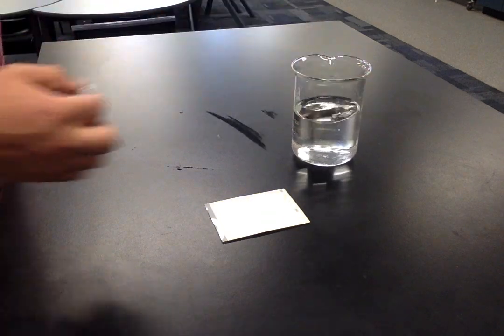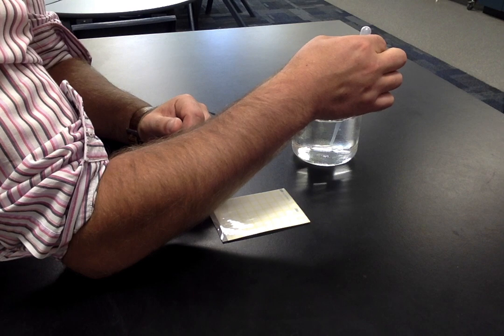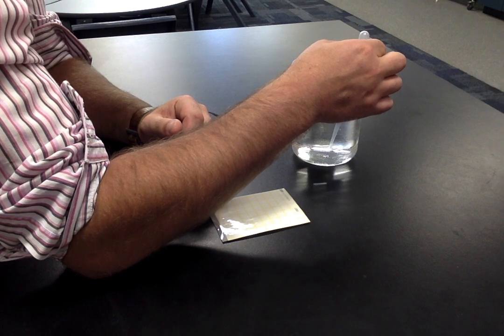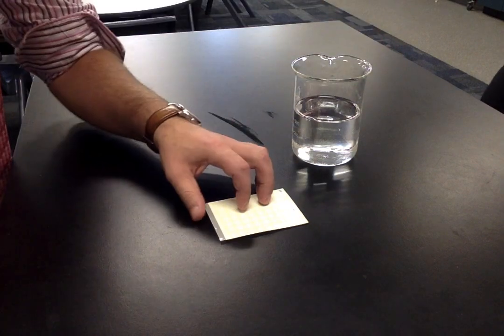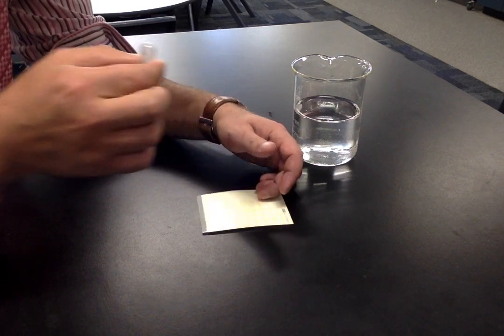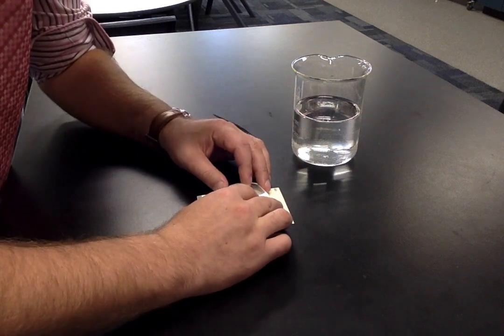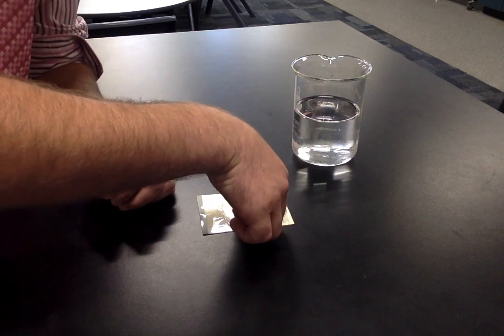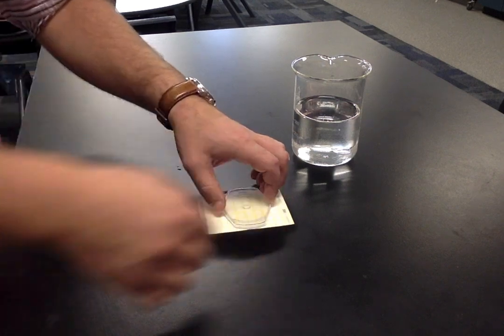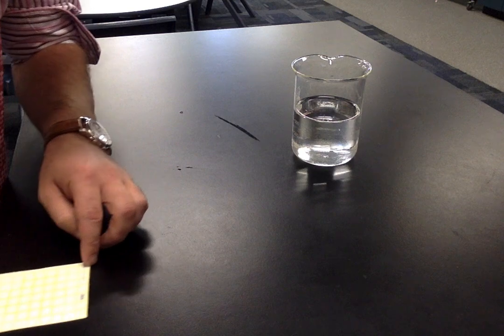Draw exactly one ml of distilled water into a pipette. The experimental control is not going to get exposed to any of the salad — it's only going to have distilled water. This is normal for an experimental control, and it will eventually accompany our samples into the incubator.